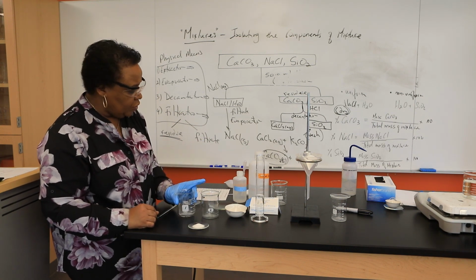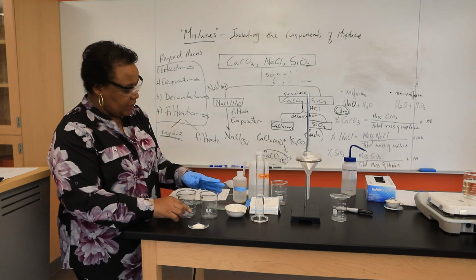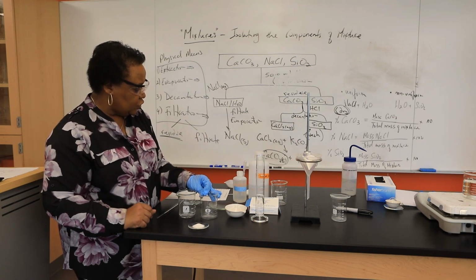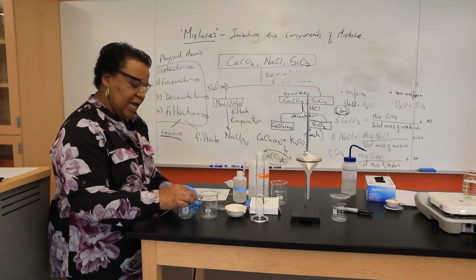This is beaker 1. And for beaker number 2, again, you'll see, of course, that the masses are different, depending on the manufacturer. This mass is 93.979 grams for beaker 2. The experiment calls for me to add, of course, what?